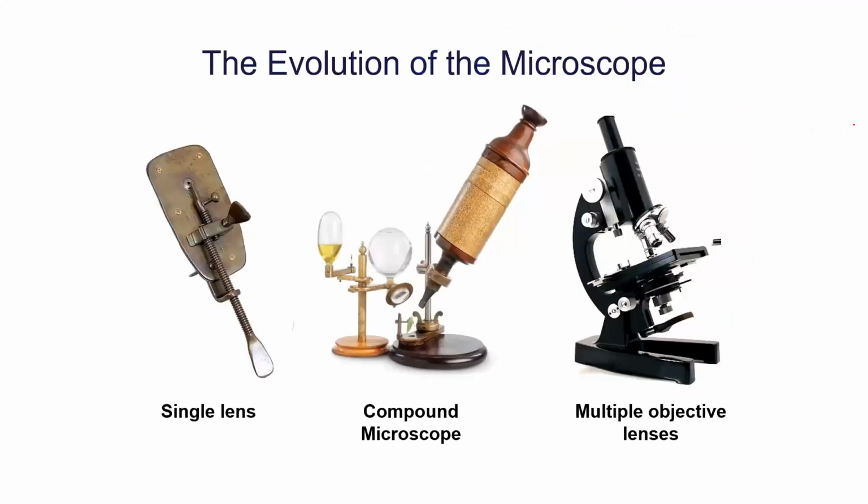So here's a quick history of microscopes. You can see on the far left is the Van Leeuwenhoek microscope. As I mentioned, it's not much more than a sophisticated magnifying glass. The lens is found right there. This contraption is just holding the specimen in place and then adjusting it so you can focus it. He was holding it up to the light, the sunlight, right?